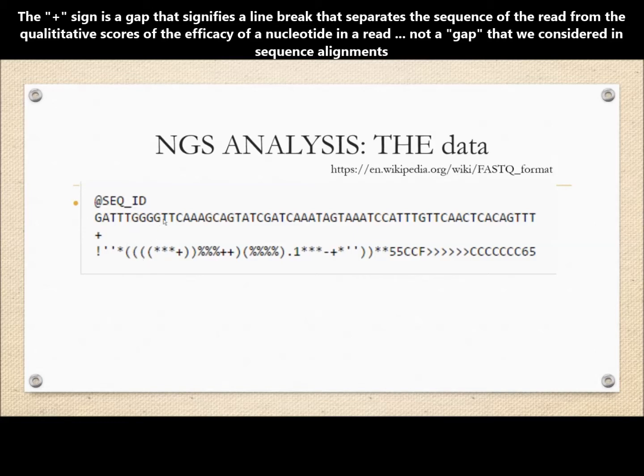For each of these residues there is a symbol, and the symbol is a representation of what is the confidence you have in that.